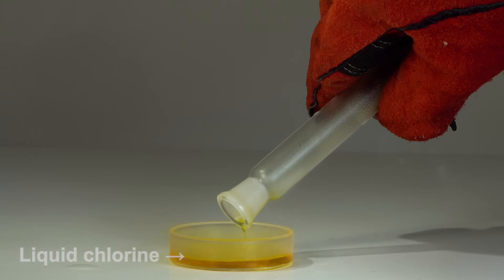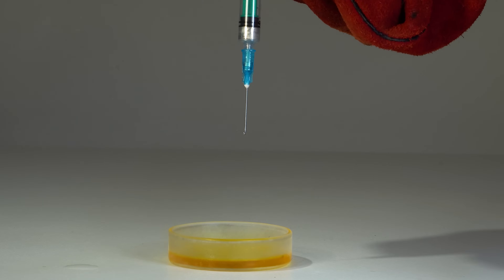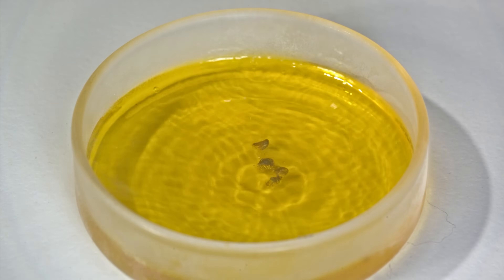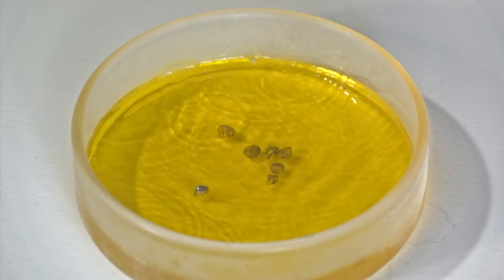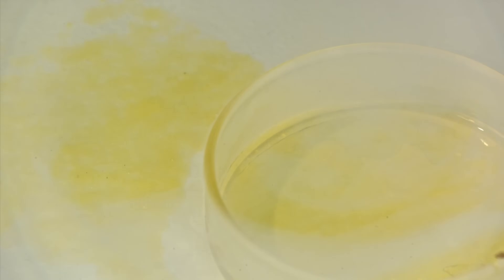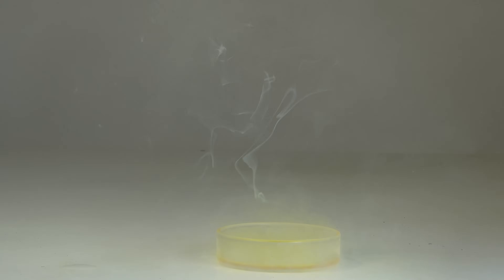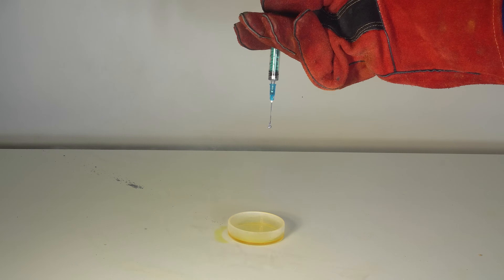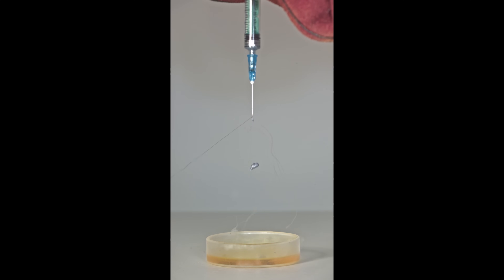Do you remember how I carried out a reaction between the potassium-sodium alloy and liquid chlorine, and it didn't react at all? Now watch how the rubidium-cesium alloy behaves in the same situation. Unlike the reaction with liquid oxygen, in this reaction the Petri dish remained intact.